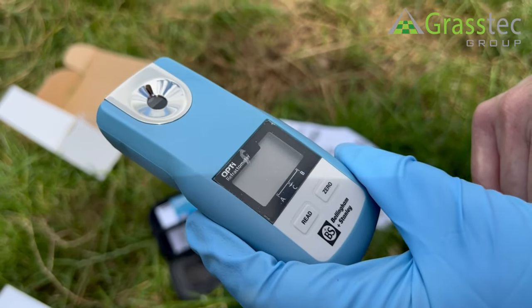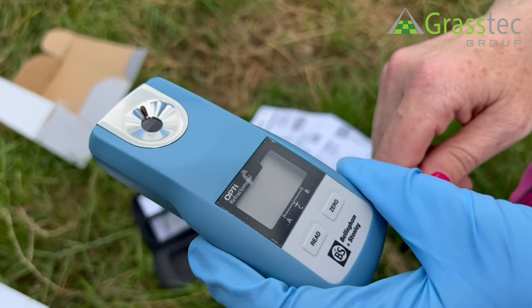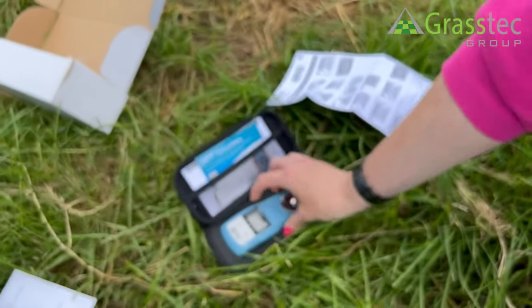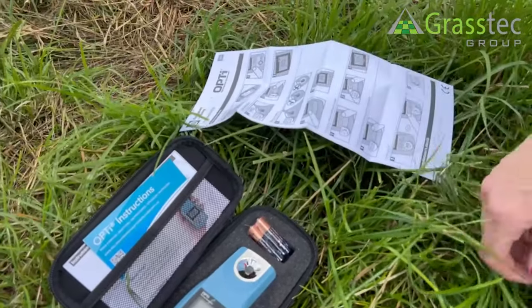whichever you're reading at the time. Put your sample here — be it grass, colostrum, or antifreeze — and then press read. It comes in this case with two batteries and the instructions on how to use it. It's very simple.